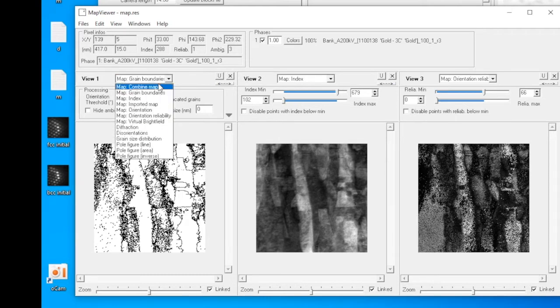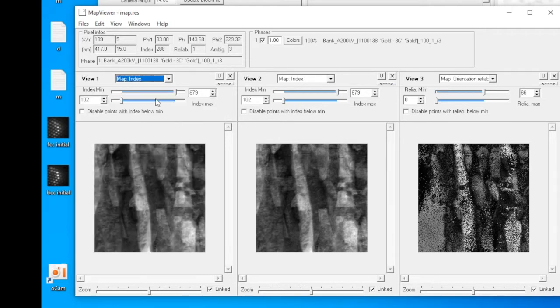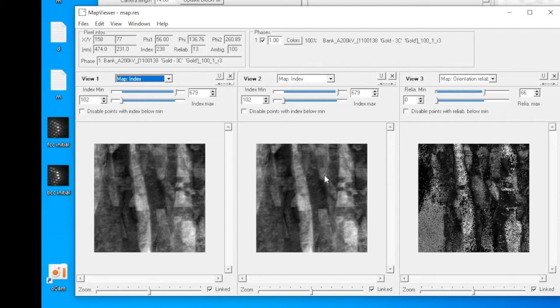The next option is Index Map. In Index Map, what the algorithm does is to compare the experimentally acquired diffraction pattern to the simulated data. If the match is good, it will be bright. If the match is bad, it will be dark.